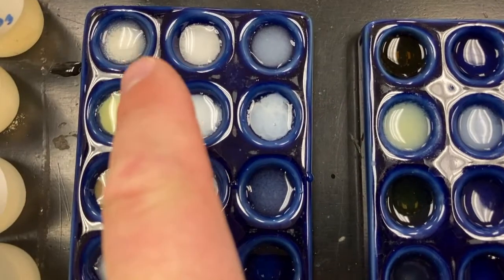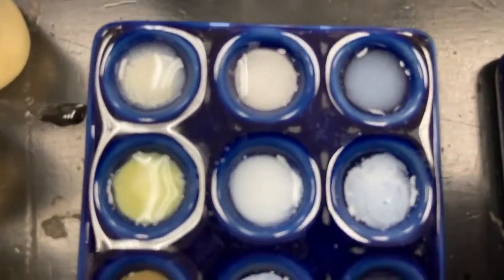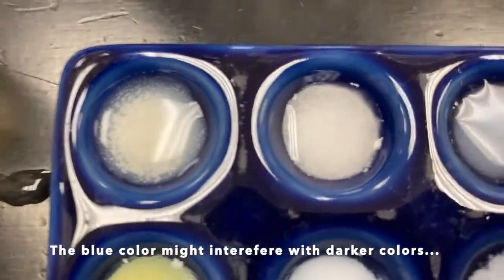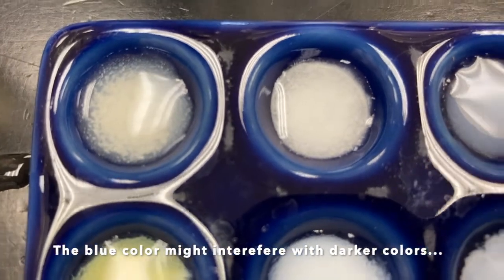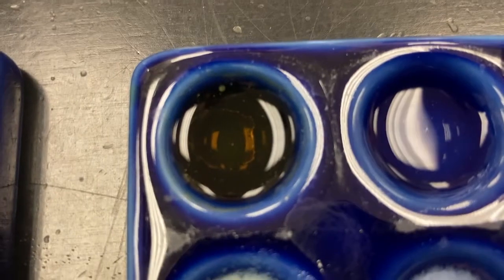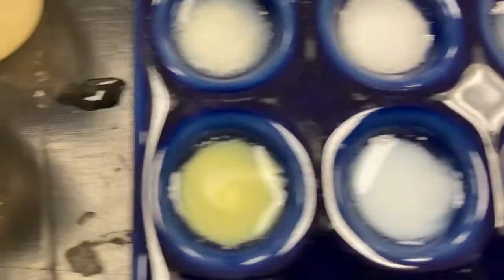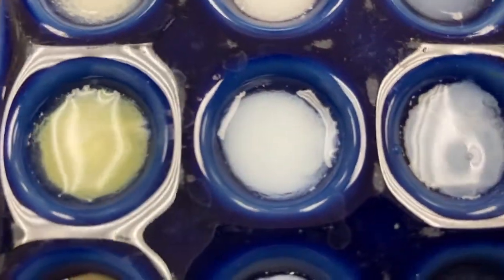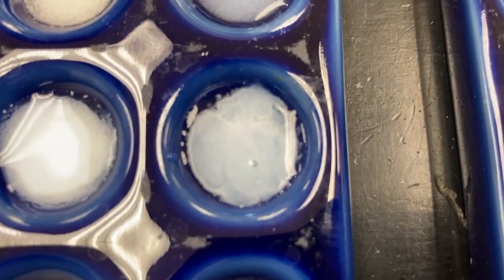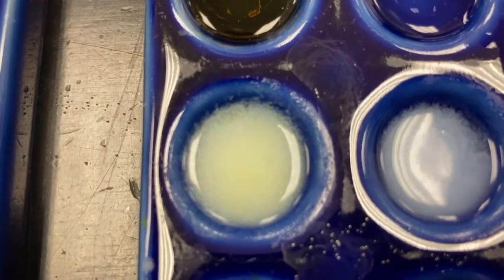Okay, now zooming in, right? This would be reaction 1. I'm going to show you reactions 1 through 6, nice and close, and you can see the tiny specks and the color maybe a little better. There's 3, 4, 5, and 6. Very tiny specks in there as well. Here's 7, 8, 9, 10, 11, 12.